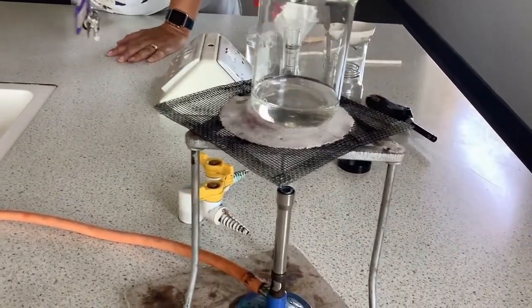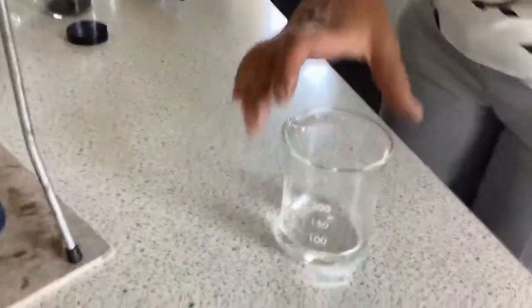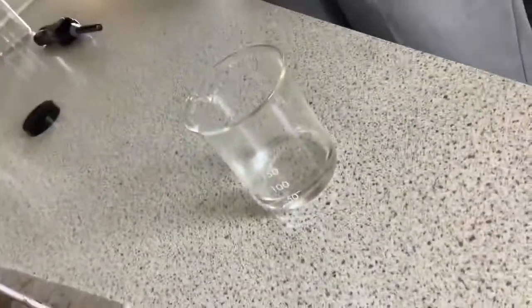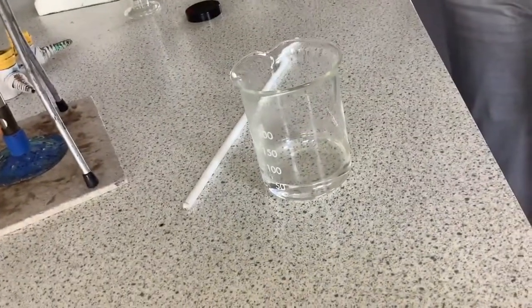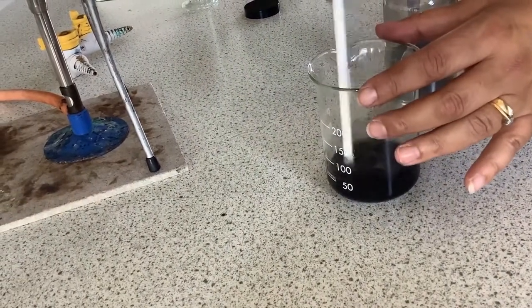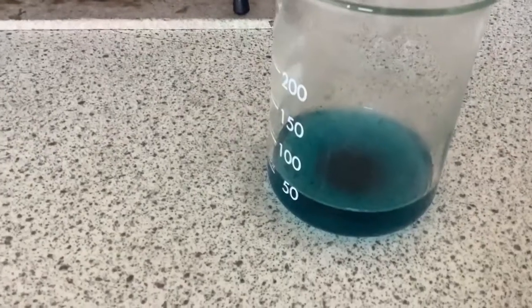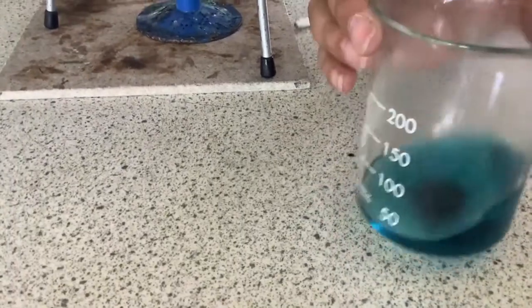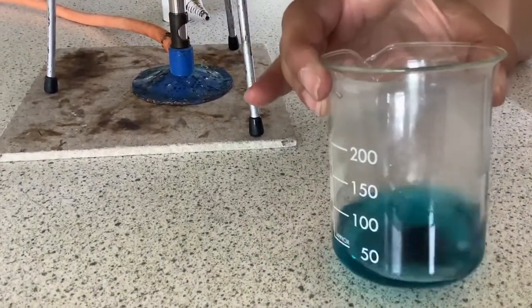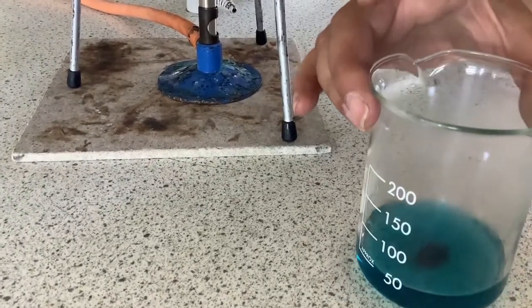Once you've heated your sulphuric acid you can turn off the Bunsen burner and we are now going to add copper oxide. We need to do this until the copper oxide is in excess, and we'll know this because it will stop reacting. Give it a stir. You can see now that we have a blue solution — we've seen a change in colour — and we still have some of the black copper oxide in the bottom of the beaker. That tells us that all the sulphuric acid has reacted with the copper oxide.